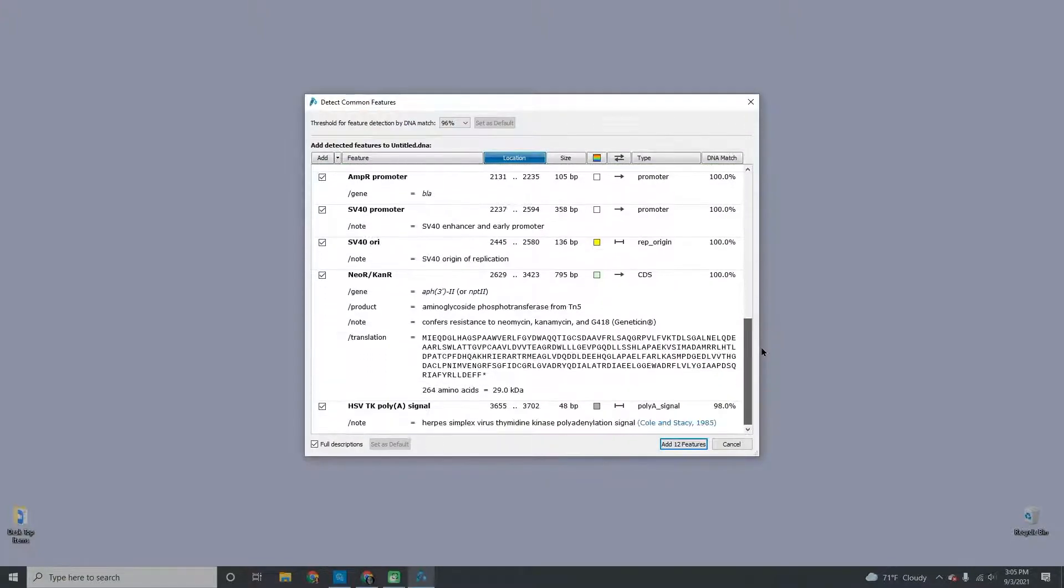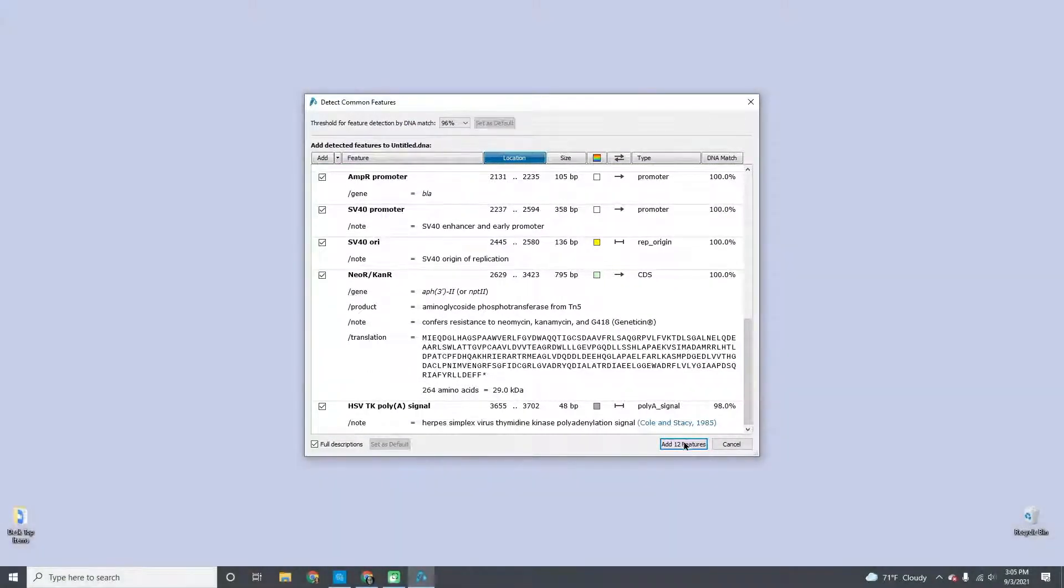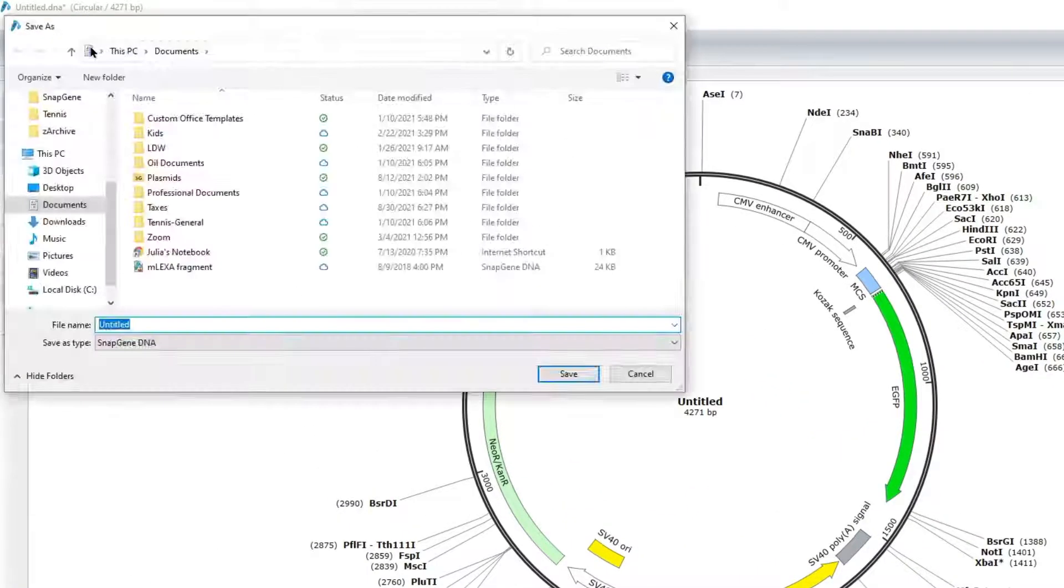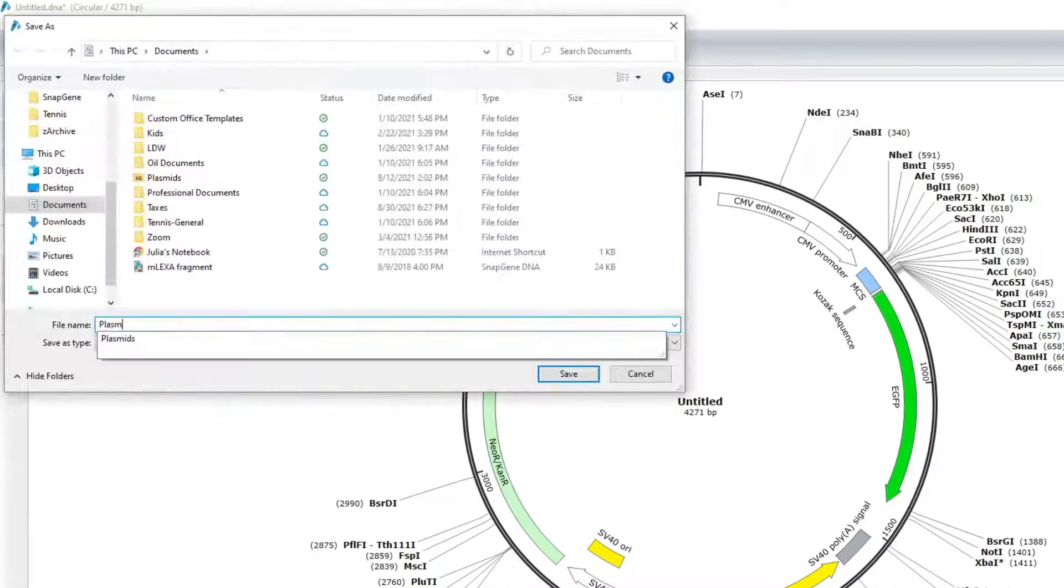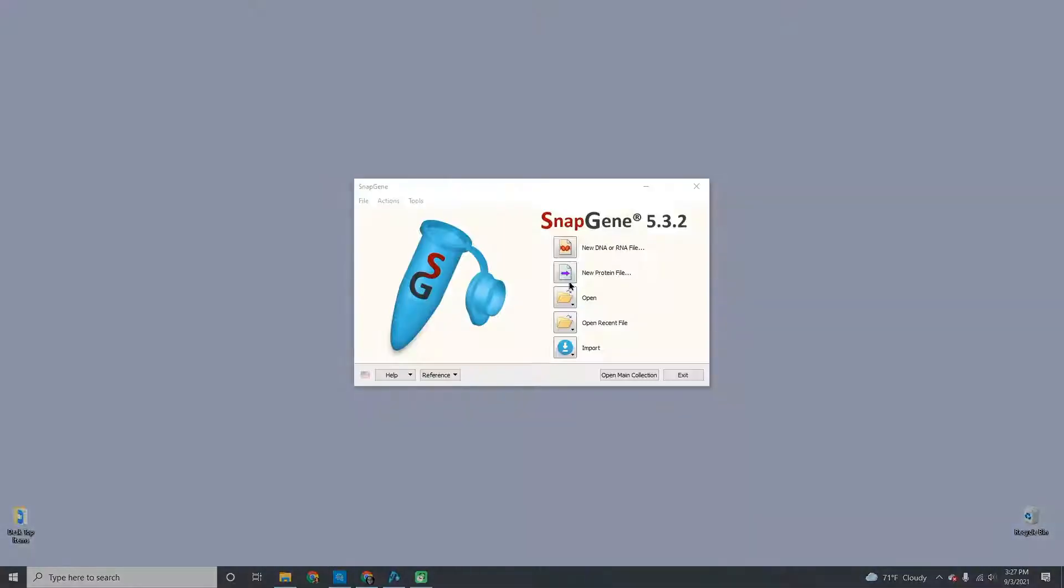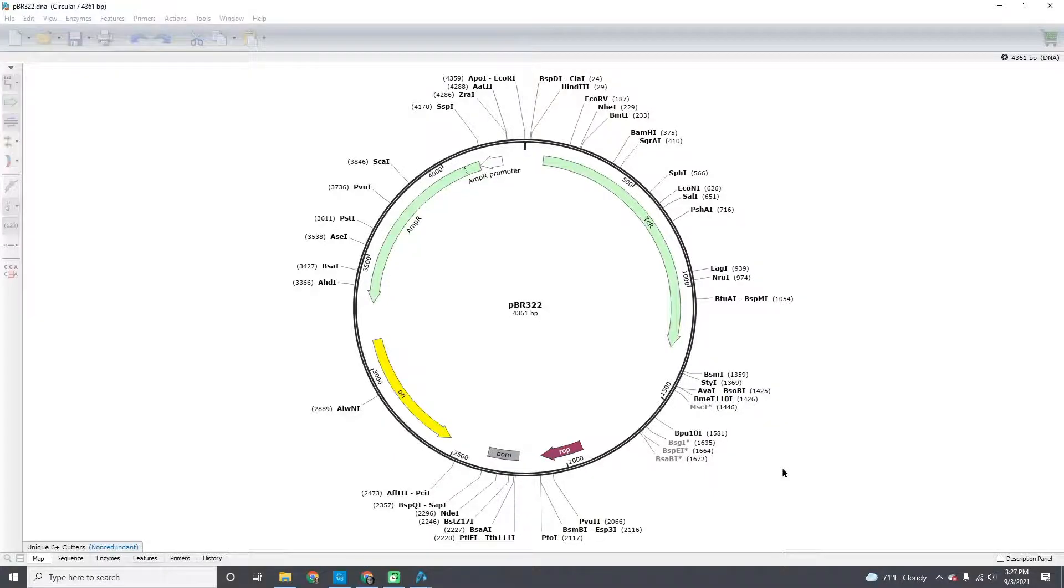Your sequence opens in the full SnapGene interface. It is easy to save your sequence the same way you would any other file. You can open existing DNA files from the launch window or directly from saved files.